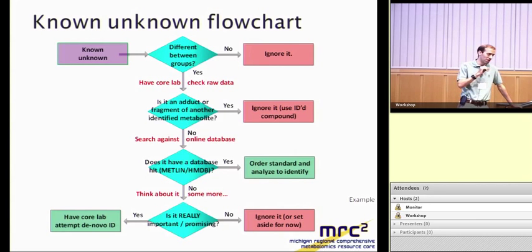We'll work to understand mass spec fragmentation patterns. We can think about trying to isolate the thing if it really comes down to it, and using other techniques like NMR. This is a very hard and labor-intensive process. It can be rewarding if you find something really unique and new, but for the most part, this is about as far as we go for most compounds, unless they look really, really interesting.